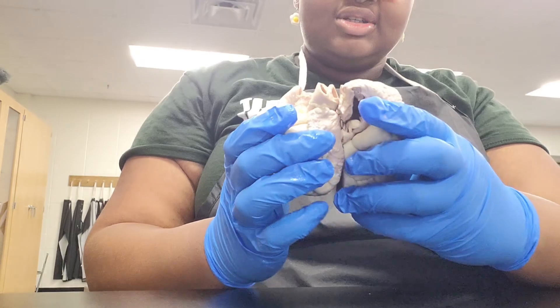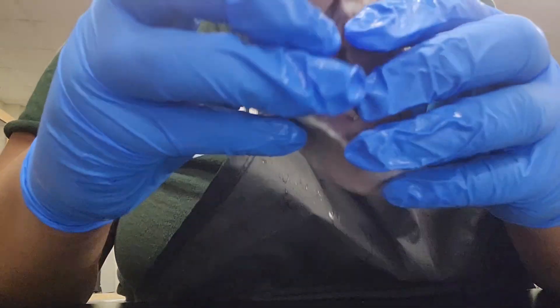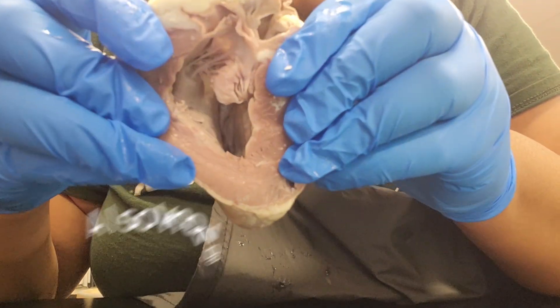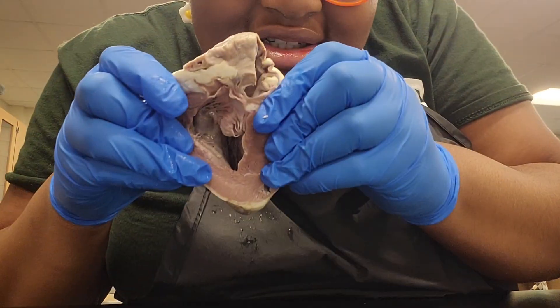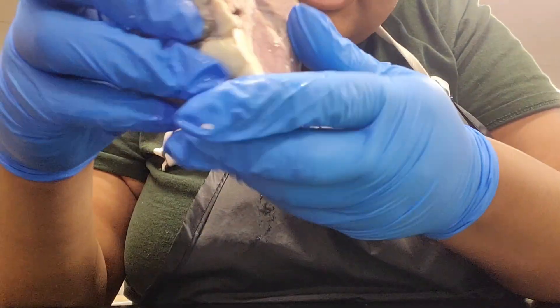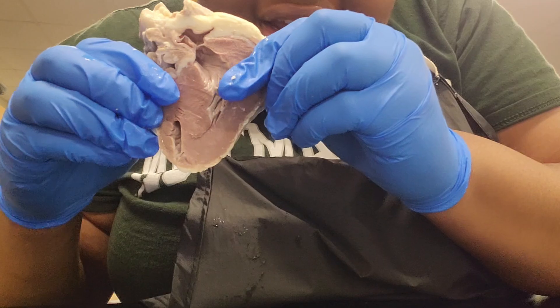Then I went ahead and examined the heart by hand. Here I show one half of the heart — I don't know what half this is, but inside you can see the heartstrings and you can see how the heart contracts so it can beat. You can also see the ventricle and atrium — at least that's what I believe they're called, please correct me if I'm wrong. Then I showed the other half, which does not have as visible heartstrings.